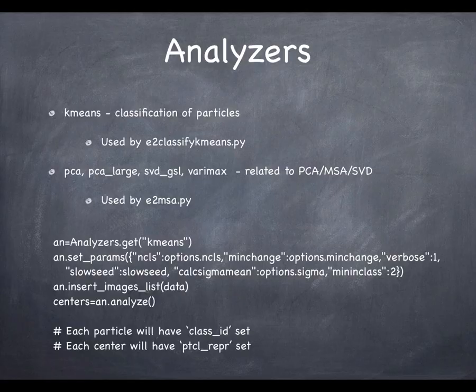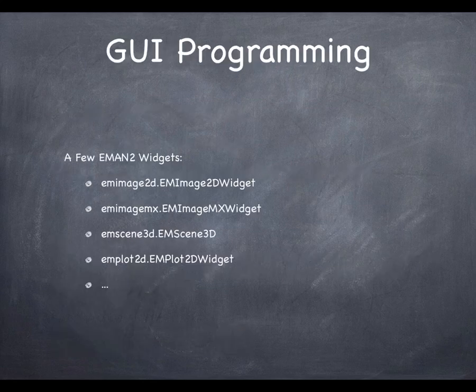And again, there's no way I can make you an expert in doing any of this image processing in a 1 hour, 1.5 hour lecture. My goal here is just to expose you to some of the different things which are available so you can play with them later on if you want to.